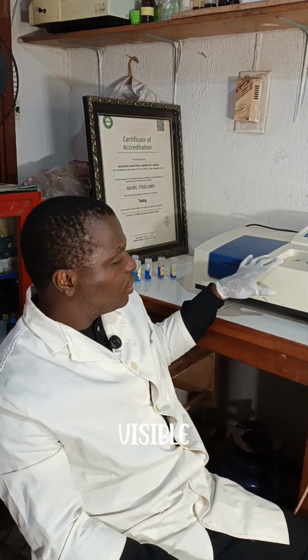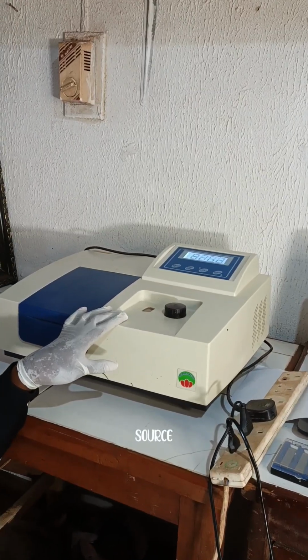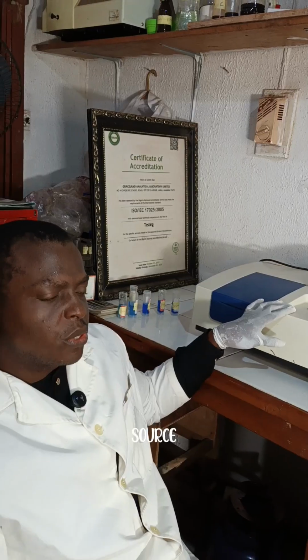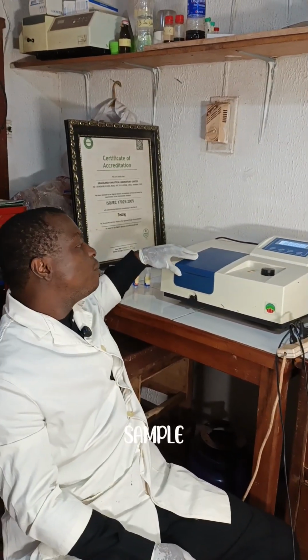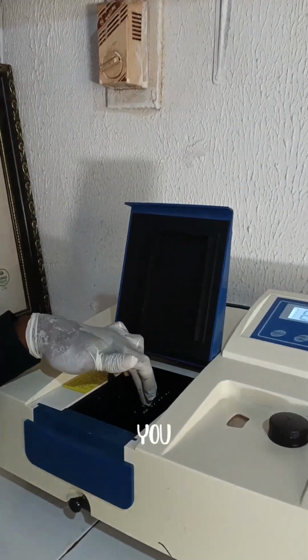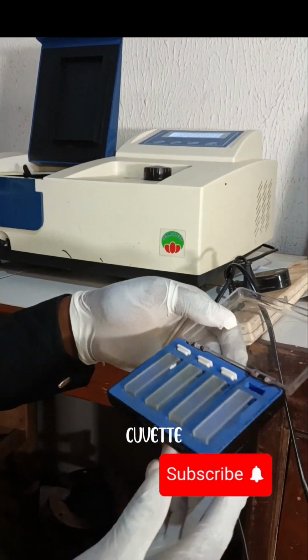In this UV visible spectrophotometer, there are basic components of it. The first of the components is the light source. Apart from the light source, you have the monochromator. The monochromator is what separates the light. And then we have the sample compartment. This sample compartment, this is where you place the cuvettes. If we see, this is a cuvette, this is a glass cuvette.